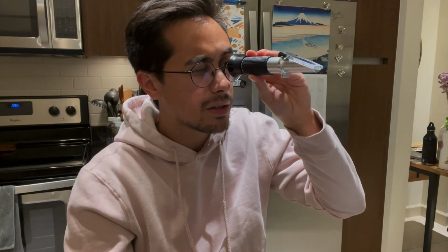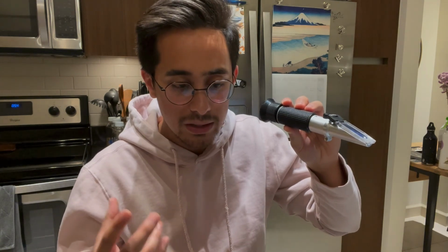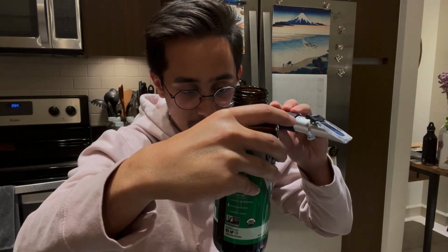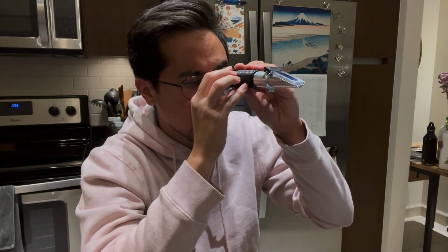Wow, okay, so this one is actually lower than I would expect. From the taste of it, it tastes really sweet. It could be just due to the extra ingredients that they add. There's a whole bunch of stuff: yumberry, star fruit, spirulina powder, spinach, all kinds of different flavors in here that make it taste sweeter. But the Brix reading here is right at 3.2. If we do our math, that's right around 15 to 16 grams of sugar. So that's accurate. So I don't know what's going on with GTs.